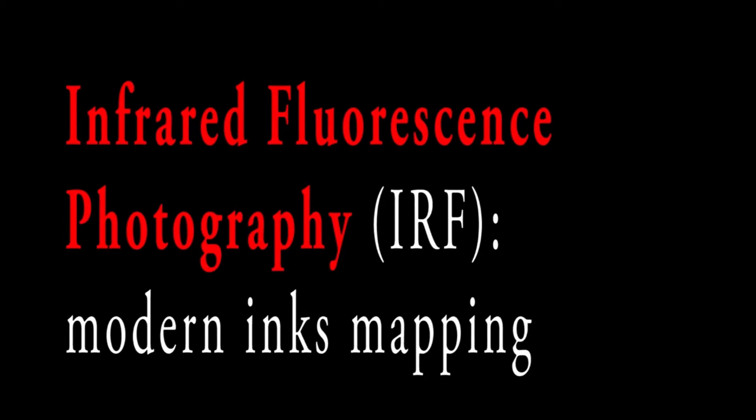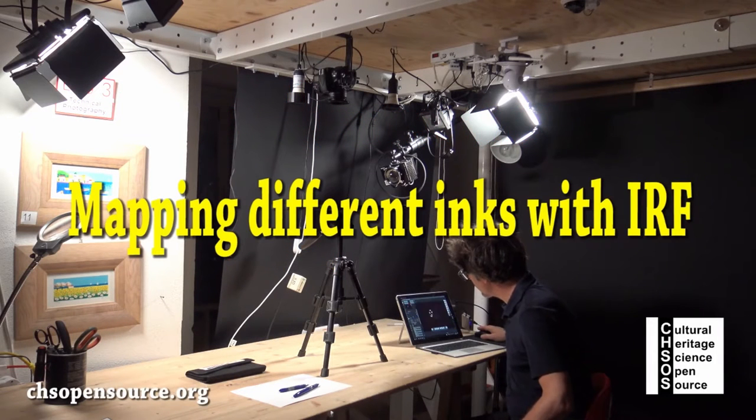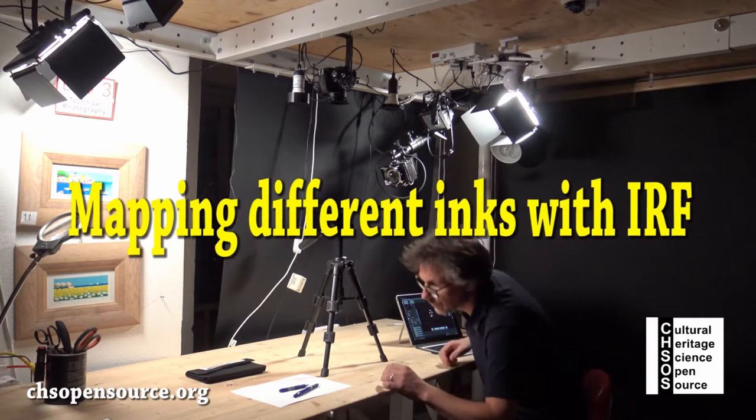Infrared Fluorescence Photography — Modern Inks Mapping. We can map different modern inks using infrared fluorescence photography.